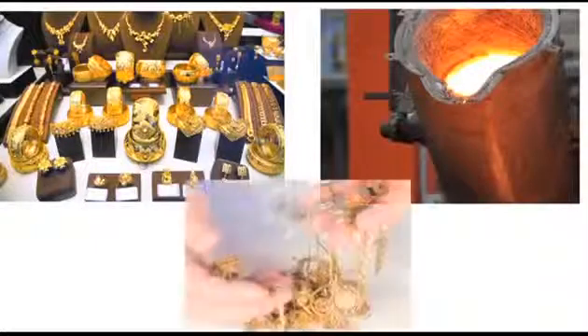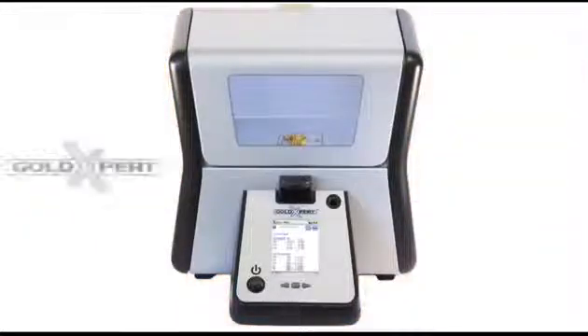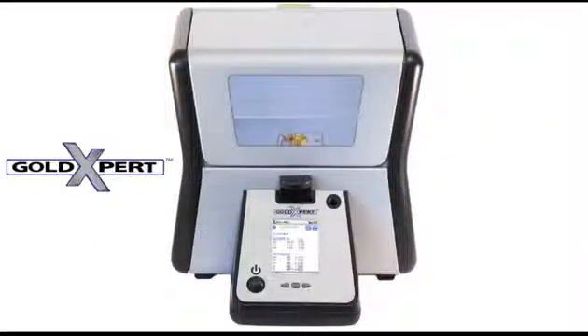Whether you are a jewelry shop owner, a refiner or a pawnbroker, the Gold Expert will give you accurate results in just seconds. It's the ideal solution for your testing needs.